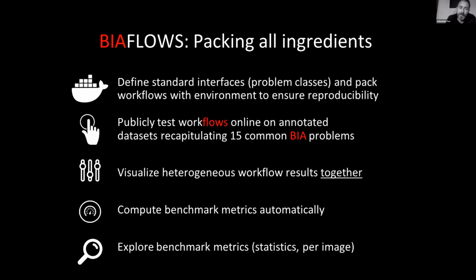And then a mechanism to pack the workflows with their entire execution environment, to ensure reproducibility. So the workflows can be tested online on a set of annotated datasets that recapitulates, as of today, 15 common bioimage analysis problems.